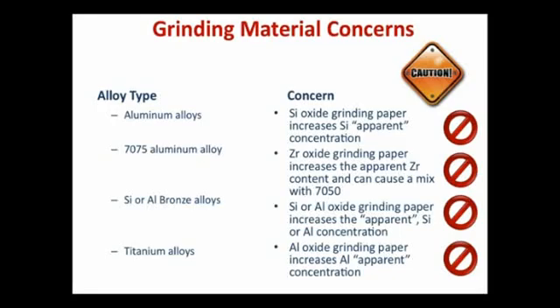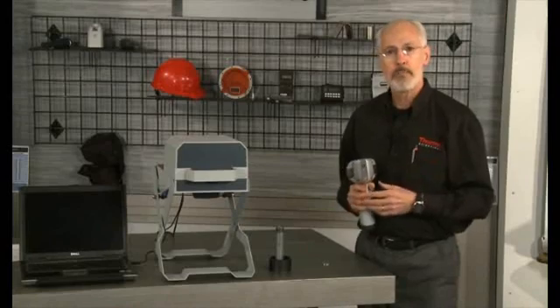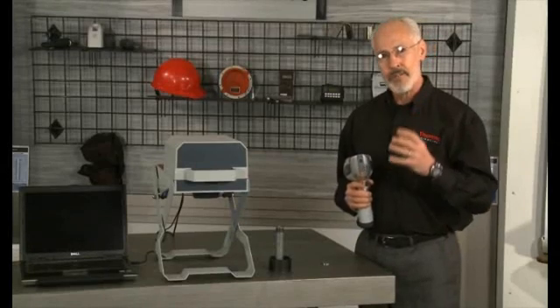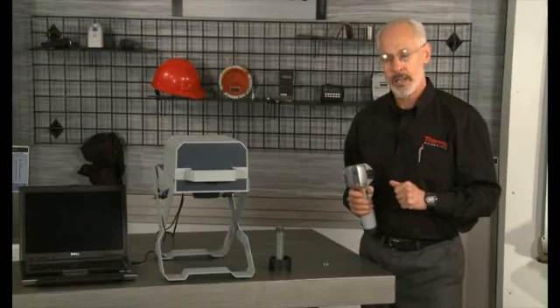Okay, now let's test a typical petrochemical alloy, a so-called chrome moly steel, such as the 5-chrome half moly. Many refinery pipelines are constructed using this alloy. Typically, the primary goal of the testing in a refinery is to verify the correct alloy grade, so we'll measure for just 5 seconds.